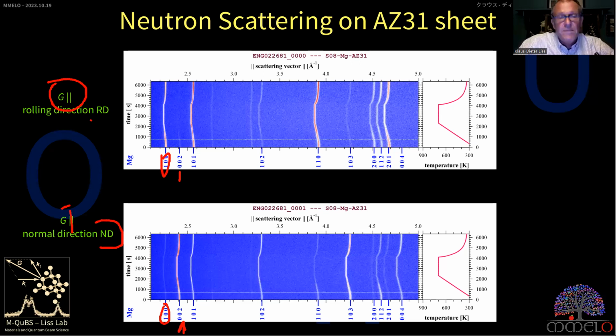What we see already in this figure is that as we raise temperature, the peak shifts. So the peak shifts somehow look like the rising temperature. Go up in temperature here from 300 to 600-700 Kelvin, and we see there's also a shift which looks very much like the temperature profile.